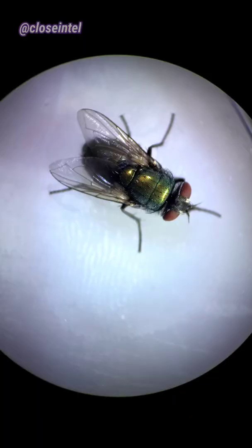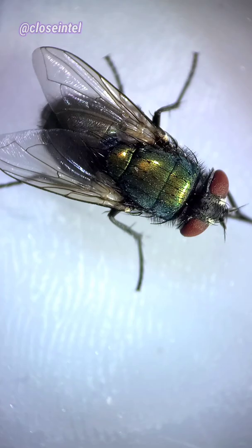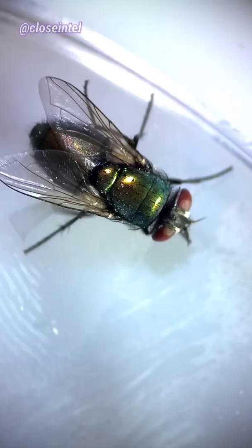So I finally captured one of these flies, and as you can see, it's already plotting something against me. The reason you see flies rubbing their hands together like this, or their legs, is actually just because they're cleaning themselves.